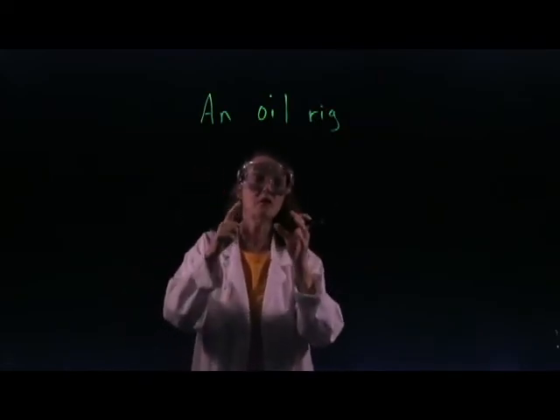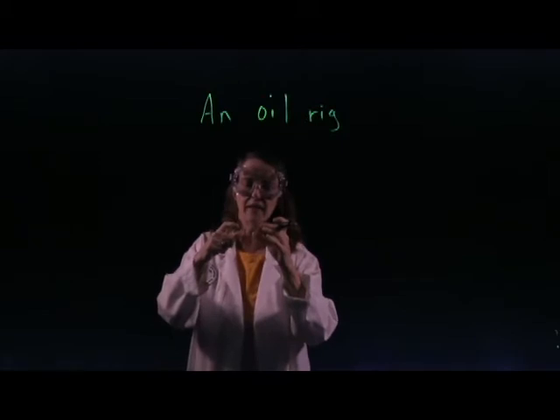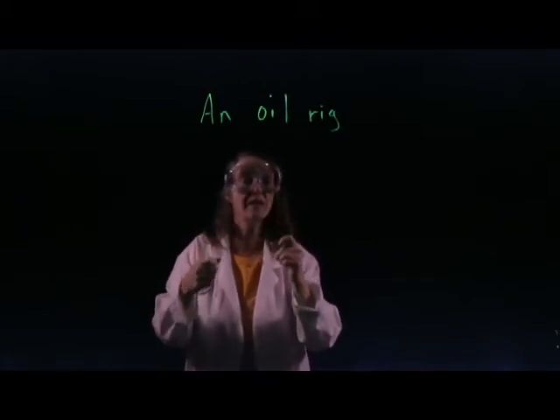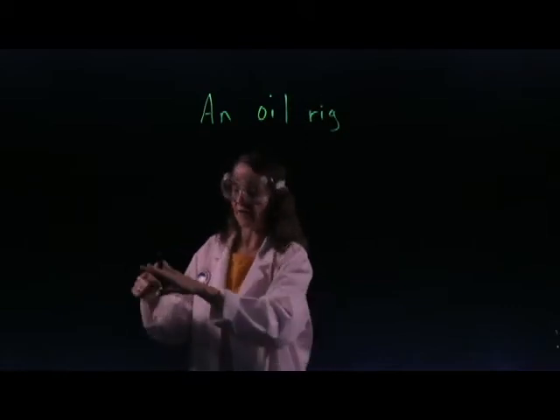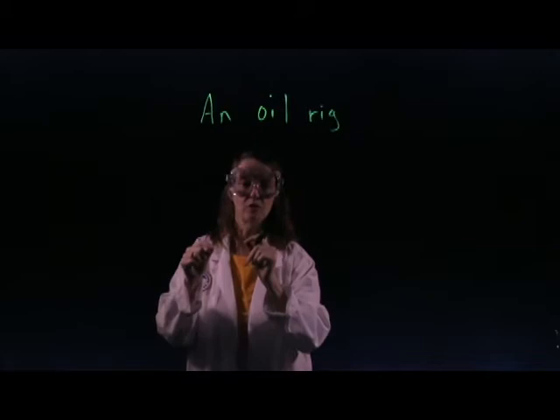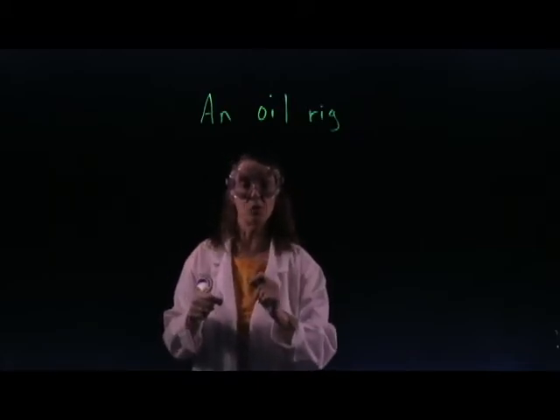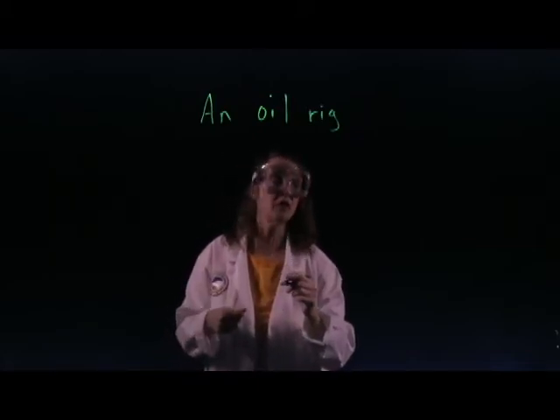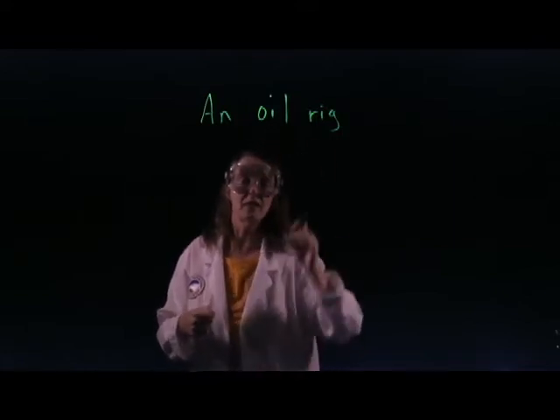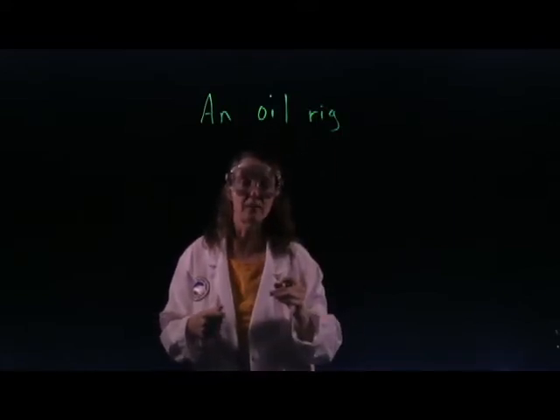So what we're going to do today is look at the electrochemistry reactions between different metals. You're going to have a collection of different metals at the front of the lab, and we're going to measure the voltage difference between them. Voltage is a potential energy difference between the site of oxidation and the site of reduction.